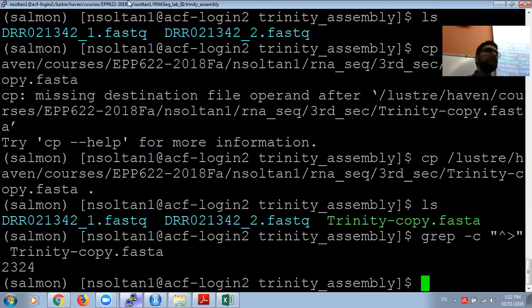Another point for this source activation through Anaconda: whenever you activate the software, it's better to deactivate it after you finish your analysis with that software, because it will just pile up together and reduce the memory that you want to use for a specific software. So it's source activate salmon. When your analysis is done, type source deactivate, and then the software is deactivated.